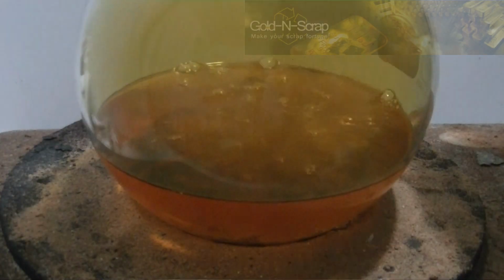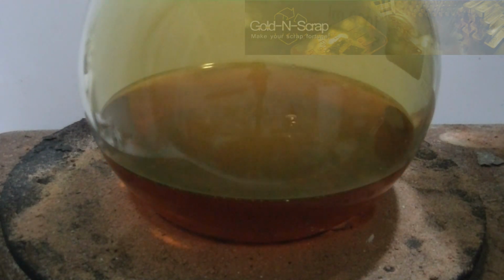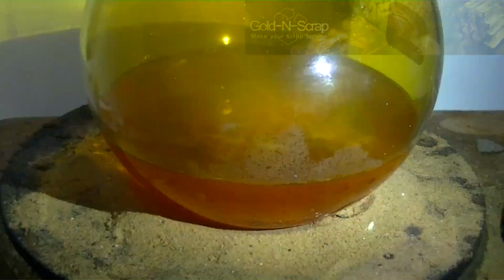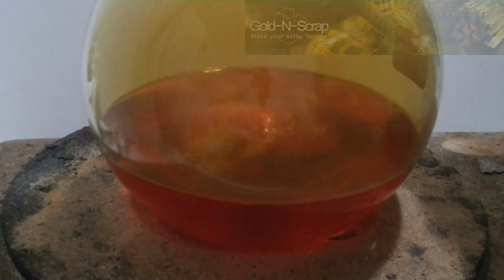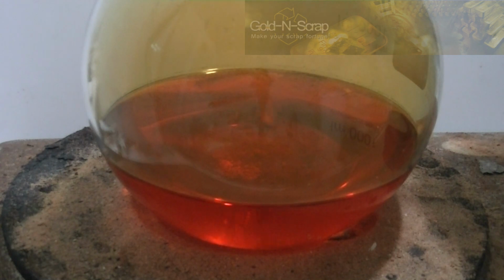I have time-lapsed the gold dissolution, though even at this speed, you can clearly see whenever a small increment of nitric acid is added. Every addition is allowed to react until it is exhausted. The point is to add just enough nitric acid to dissolve the metals. That's it. Please do not follow recipes that call for pre-mixing the aqua regia.